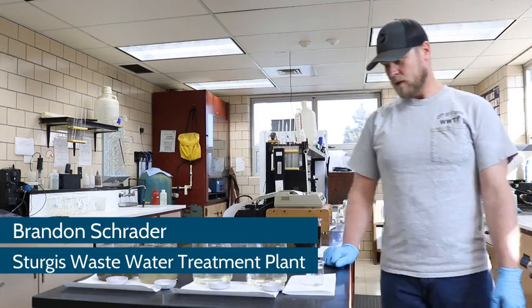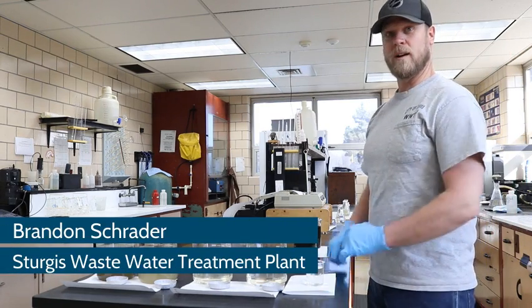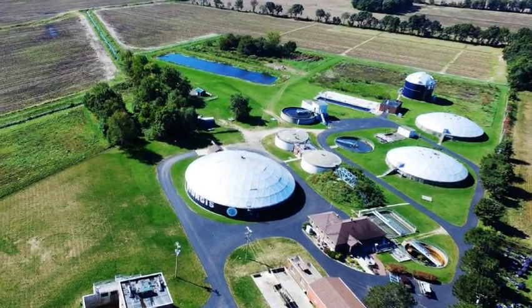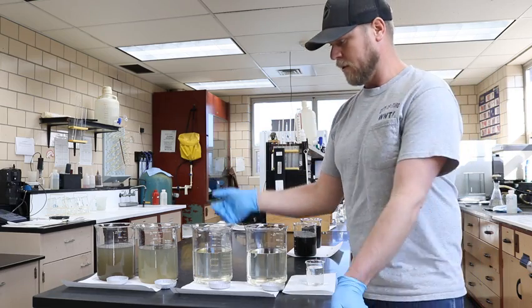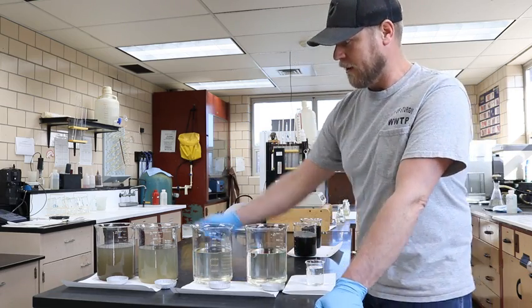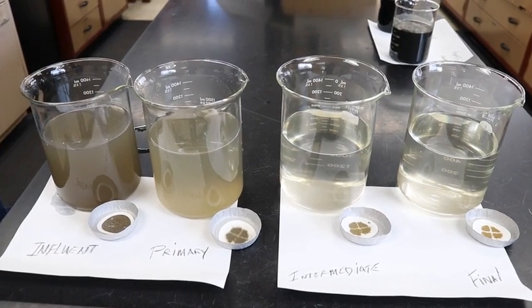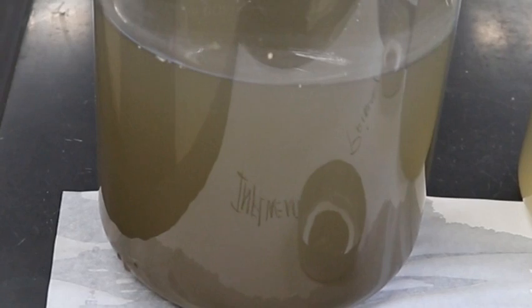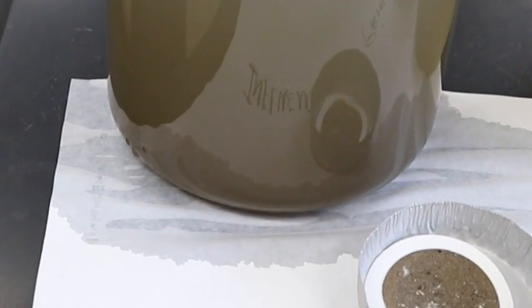Alright, well, welcome to the City of Sturgis Wastewater Laboratory. You already had a tour of the outside of the plant. Well, this is what we're looking at on the inside. This is what comes out of our influent, right after grit and screenings from the Headworks building. You can see it's pretty murky.